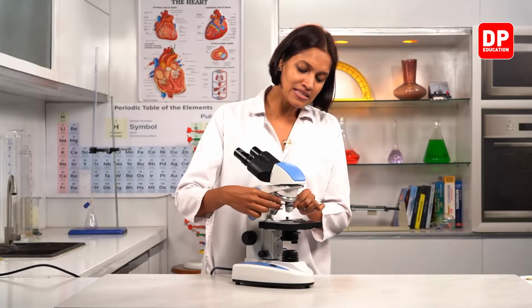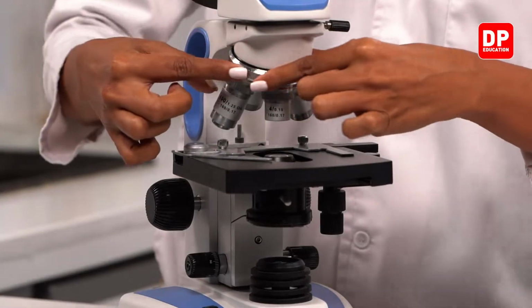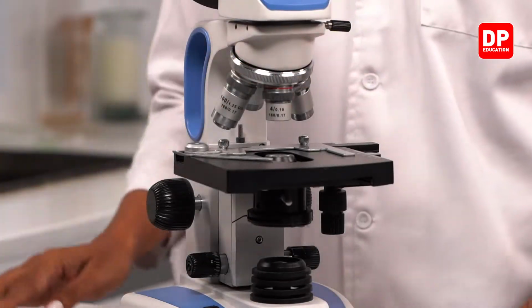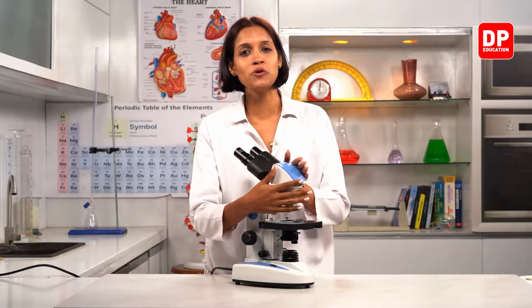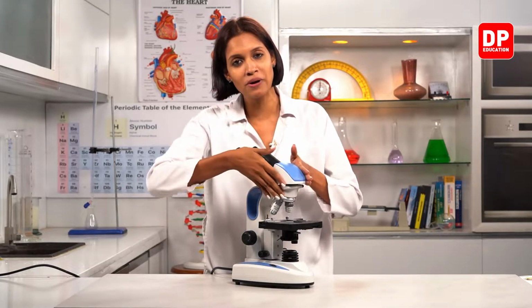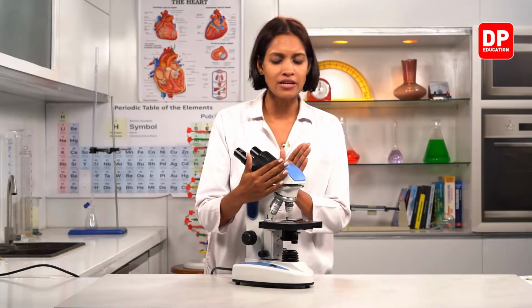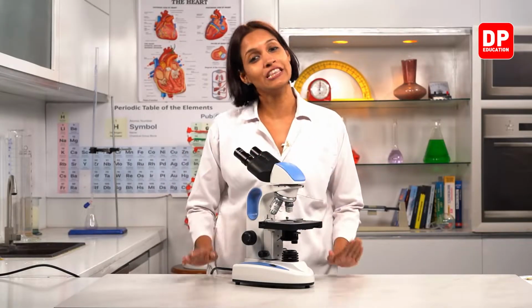Now these lenses are connected to a plate-like structure. This can be rotated. This is known as the nose piece, right children? In a basic microscope, this whole part is known as the body tube. The shape is a little bit different, right? But this is the similar thing.